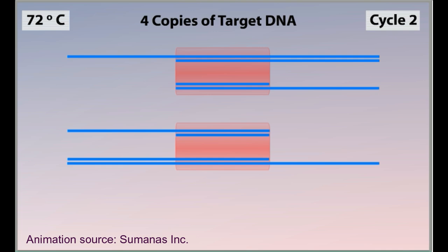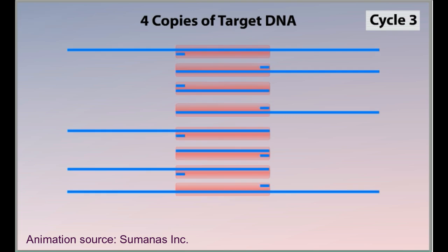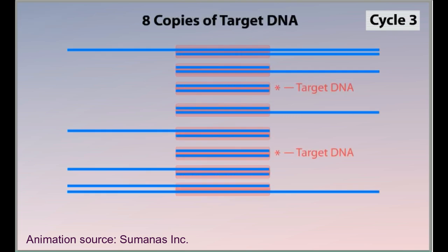After cycle 3 is finished, there are 8 copies of the double-stranded target DNA sequence, and note that only 2 of the double-stranded copies consist of just the target fragment, and the others also include flanking DNA regions.